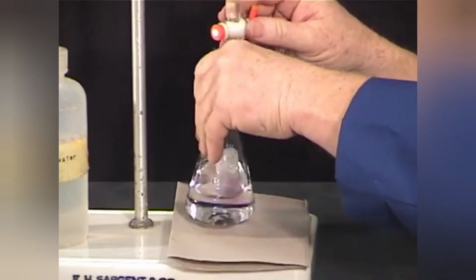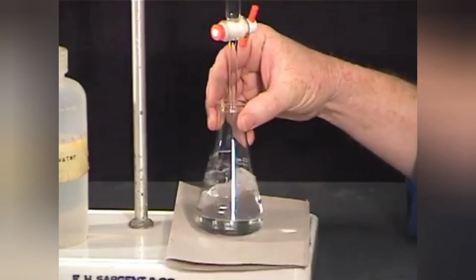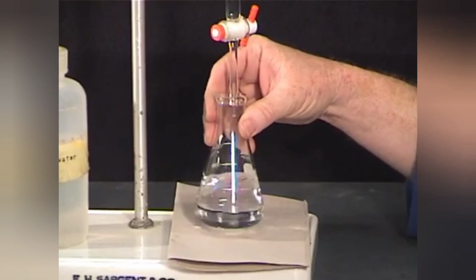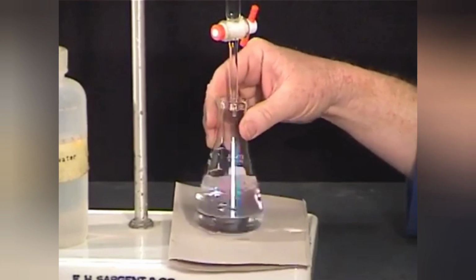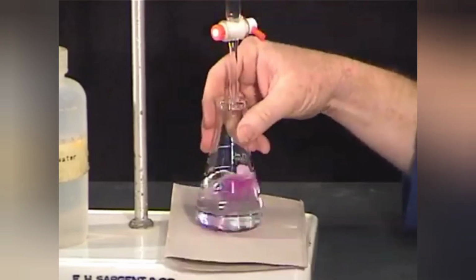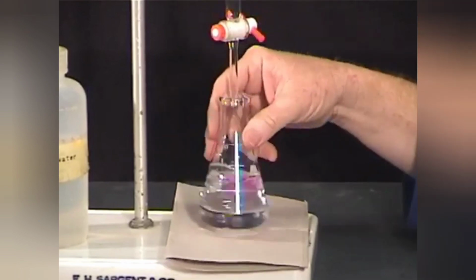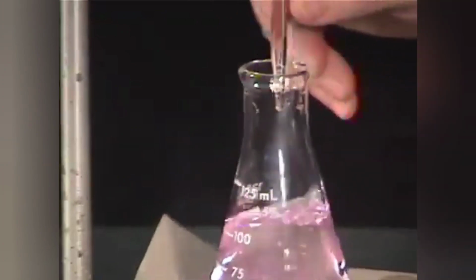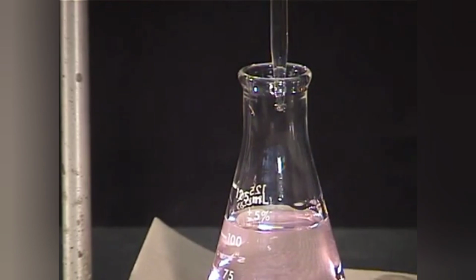Initially, you may add the titrant rapidly while swirling the Erlenmeyer flask. The indicator will begin to change color in regions of high titrant concentration, but with swirling, the color will disappear before the equivalence point is reached. Slow down the titration when the color change becomes more pervasive and begins to linger throughout the flask. Add the titrant dropwise at the end. At the very end of the titration, you can add a split drop by touching a hanging drop of titrant on the nozzle to a stirring rod, then stirring it into the solution.